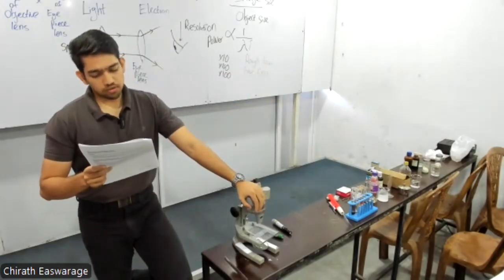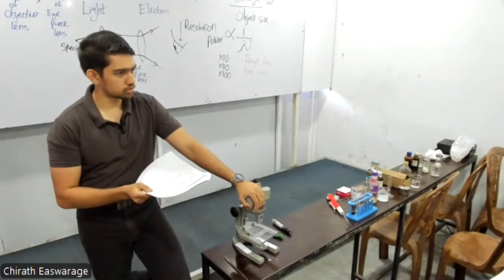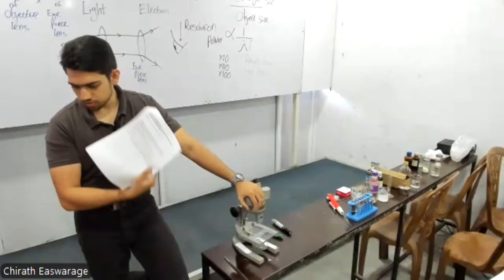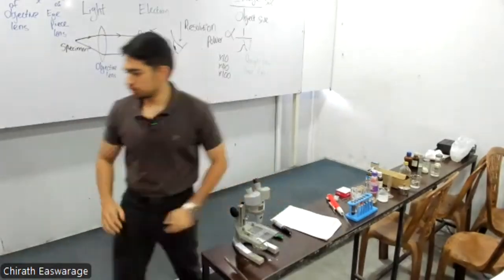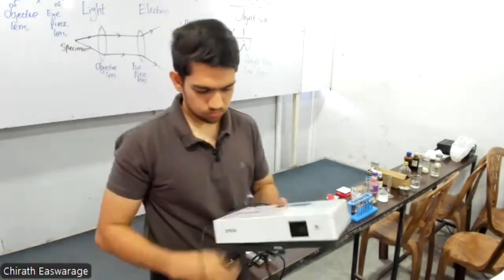Then resolution power and magnification are important parameters. You can write down the definitions here. Can you see this space? Magnification is, please write down. What's the definition of magnification? And write down the definition of resolution power as well.